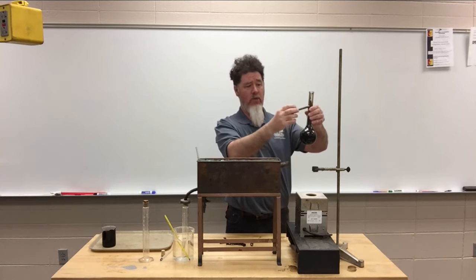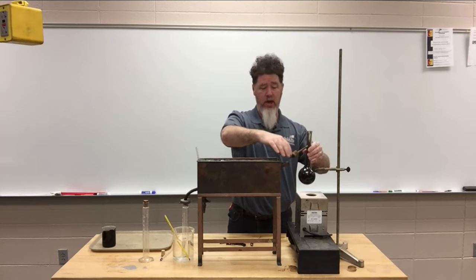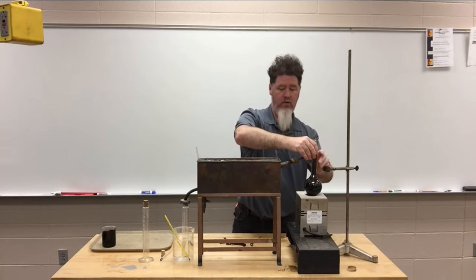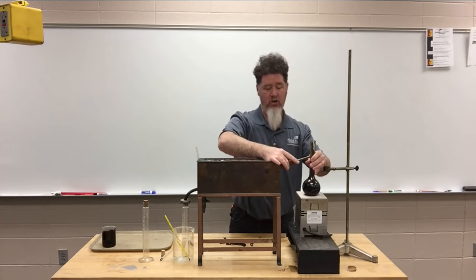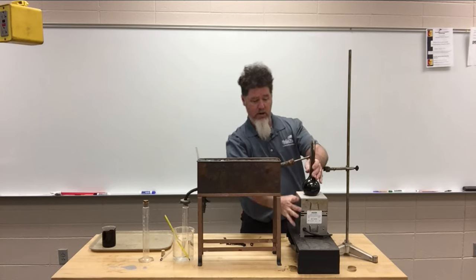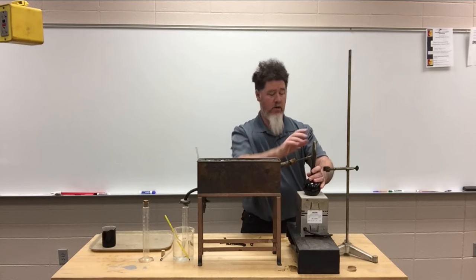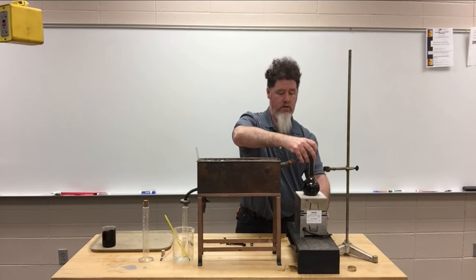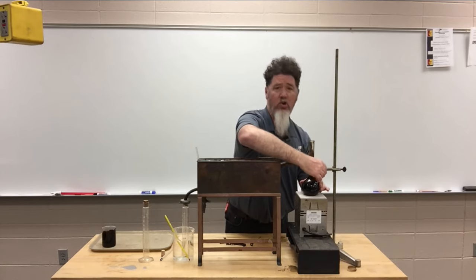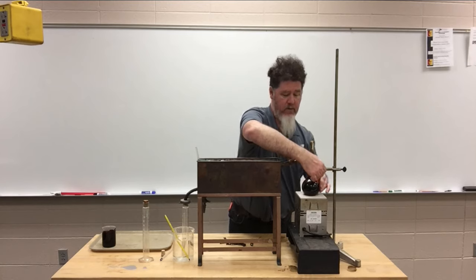I have a cork in this, and what's going to happen is I'm going to put this on the heater, and this cork is going to go into a condenser, is probably the best way to say that. I'm going to stick this in where the tube is, in the condenser, maybe an inch or so, maybe 2 inches at the most, and get my heating mechanism set up really level. And I'm going to put this fixture on it to hold it so I don't knock it over, because that would be very bad, because we're going to heat up this oil pretty good.